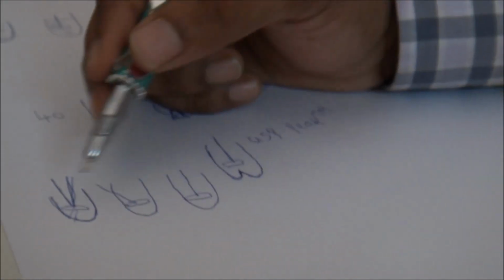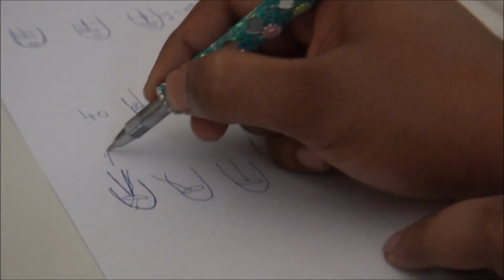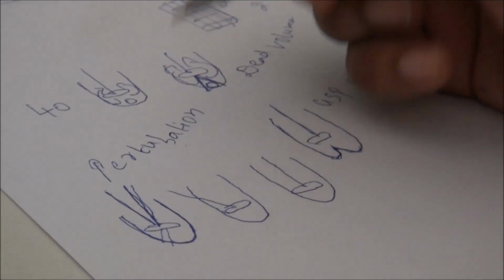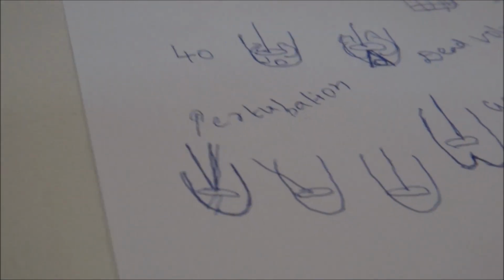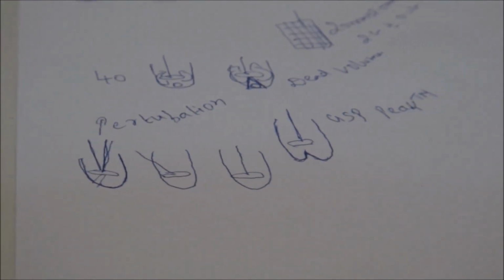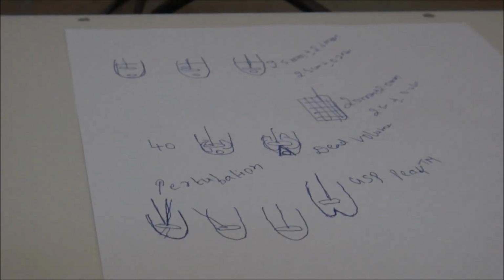These types of studies are referred to as perturbation studies. Perturbation studies are generally employed in dissolution just to understand whether there is a coning effect. Thereby, by avoiding the coning effect, we are going to interpret the in vitro drug release as correlated exactly with the in vivo release.